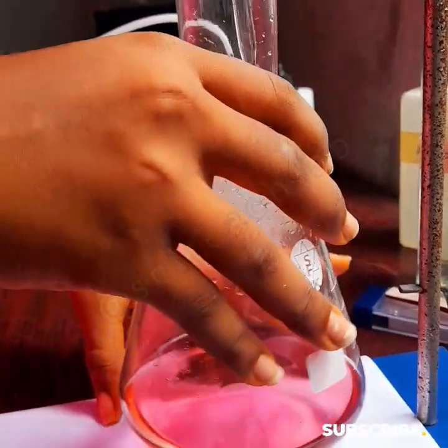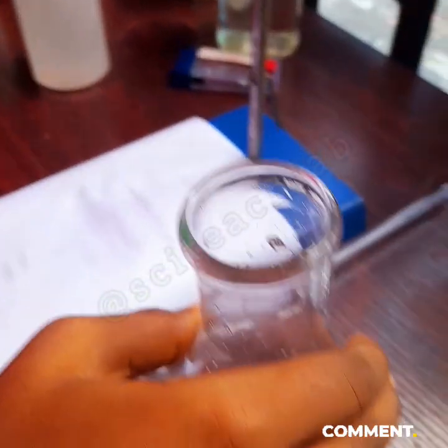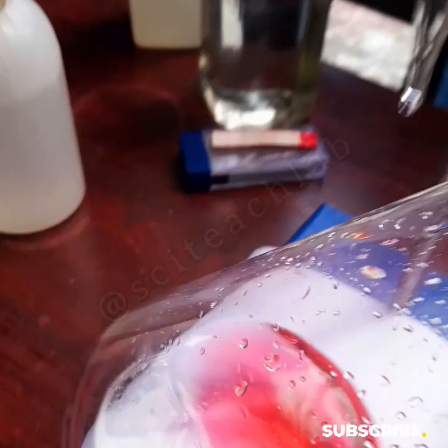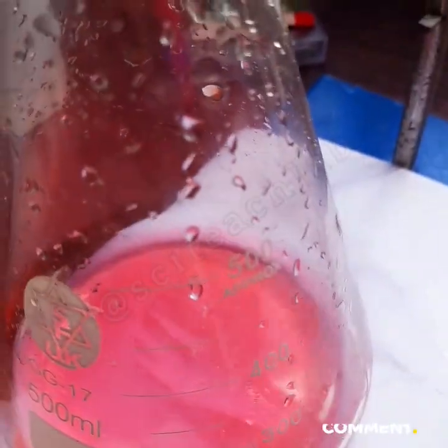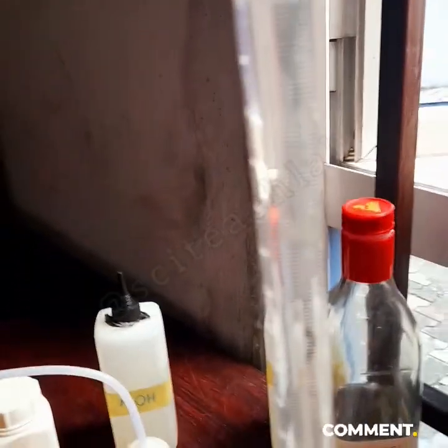This is not a neutral solution anymore. This is maybe an acid. If you put in your litmus paper, it will show that it is an acid. So avoid dropping it too much. Once your endpoint is reached, please, if the stopper is not working, remove the conical flask. All right, so you can then go ahead and take your measurements.